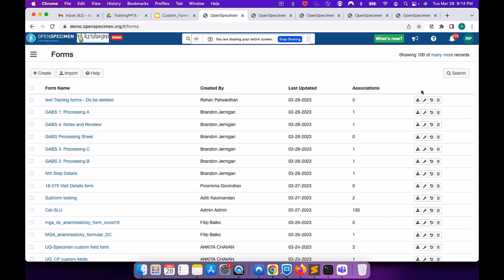See, officially we do not support these things because when you change the screen sizes, it becomes very difficult. Not everybody is technically sound enough that design becomes responsive. So we do not really recommend doing that. But you have an option to download form XML from here.